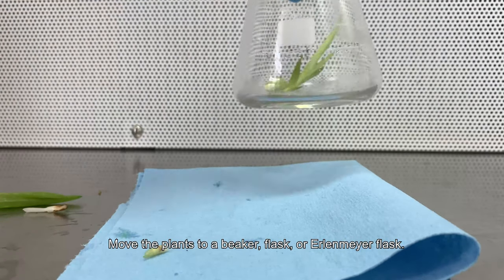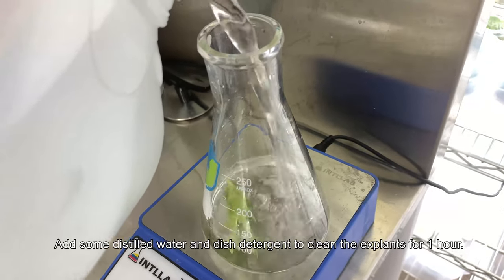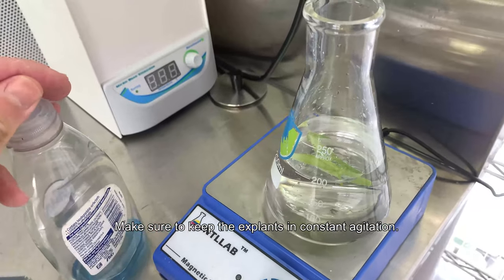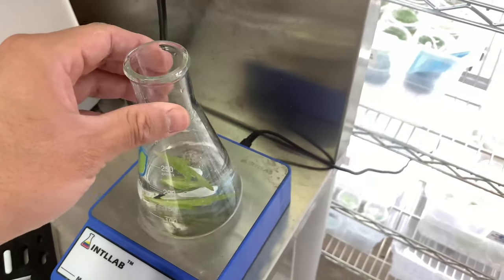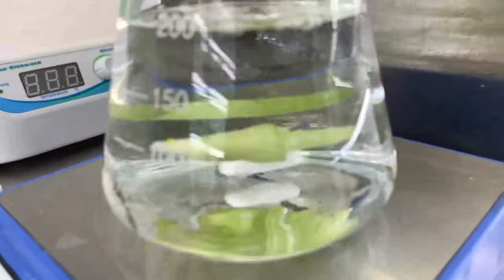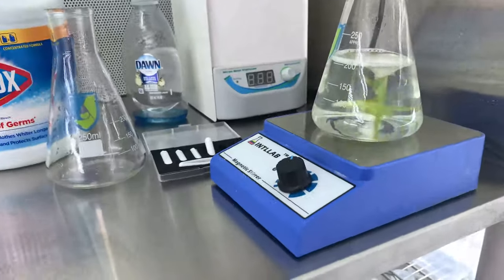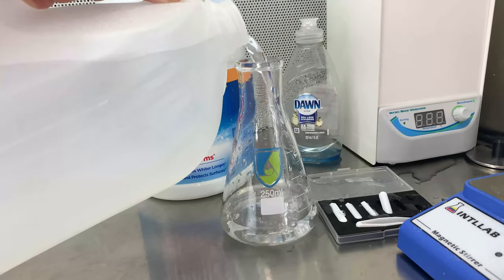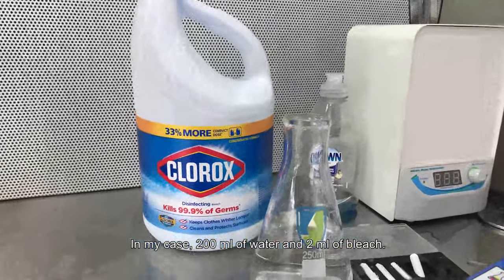Move the explants to a beaker, flask, or Erlenmeyer flask. Add some distilled water and dish detergent to clean the explants for one hour. Make sure to clean the explants in constant agitation — I like to use a magnetic stirrer. After an hour, move the explants to a 1% bleach solution.